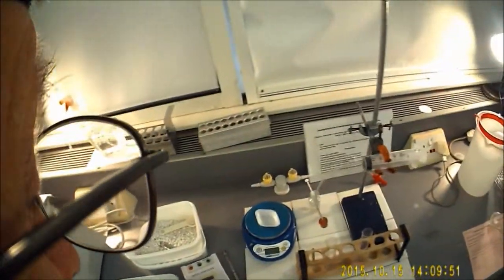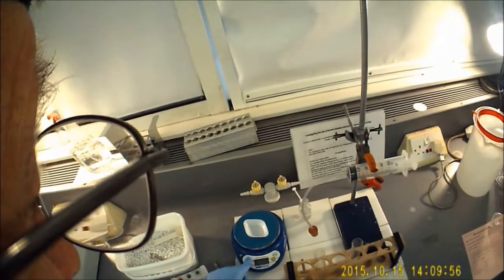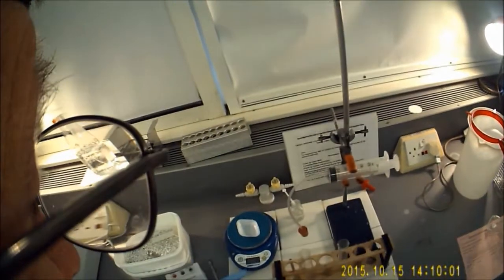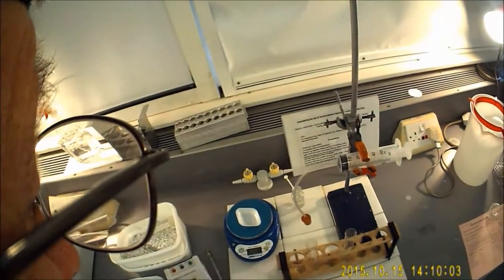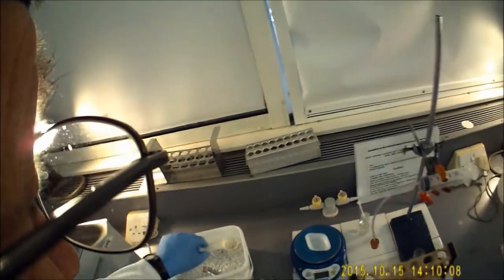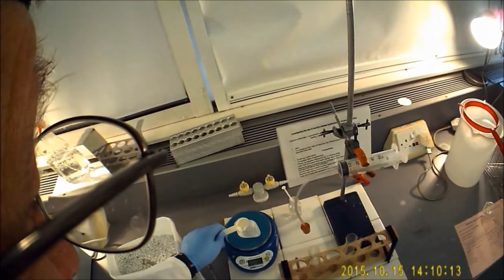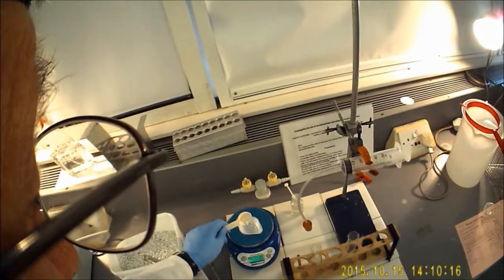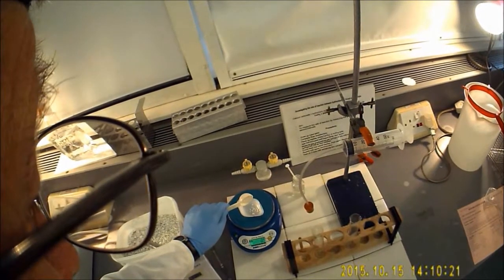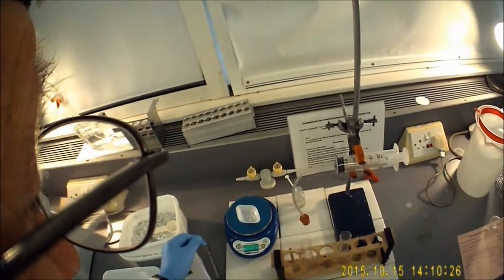The first thing you need to do is to weigh out one gram of calcium carbonate or marble chips. Put your weighing boat onto the scales and make sure you zero the scales. We don't want to weigh the weighing boat. And then you're going to add your calcium carbonate until you get one gram. And that's pretty much exactly one gram.